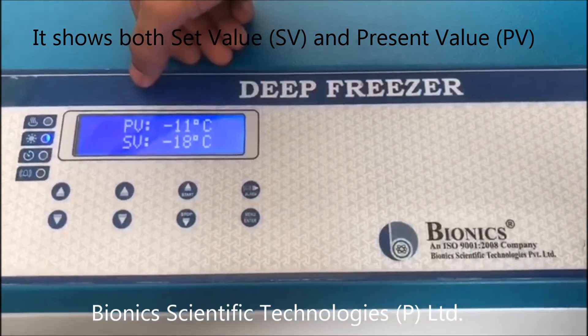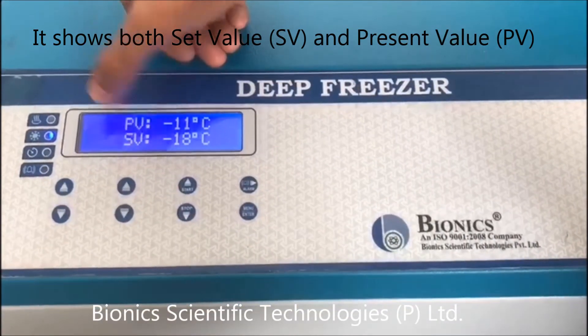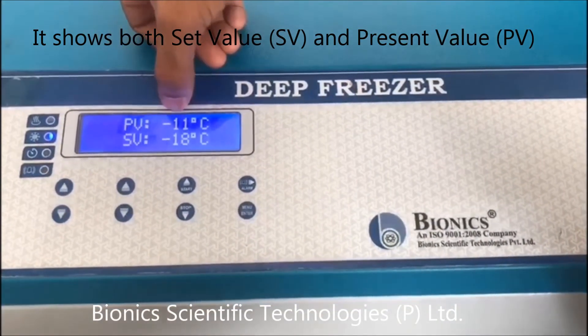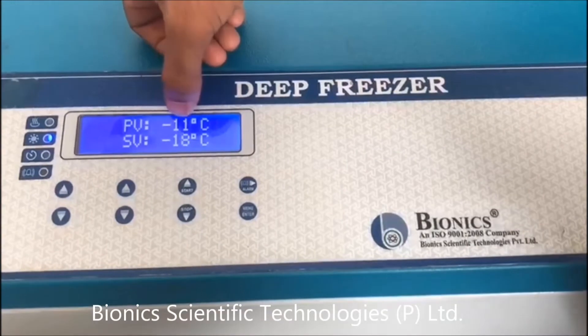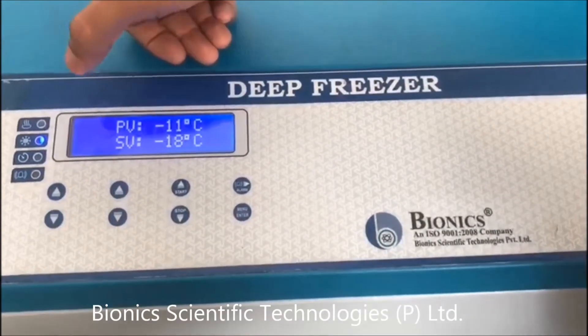PV indicates the present value. The present value right now is minus 11 degrees Celsius, and the set value is minus 18 degrees Celsius.